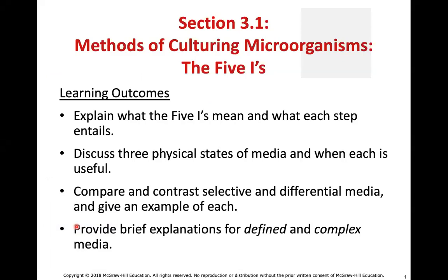Morning, all. So this chapter is chapter 3, which is tools of the lab or tools of microbiology. And we're going to go over a lot of the stuff that you would typically be doing within a microbiology lab. Pretty much cultivating these microorganisms, various tests to identify these organisms, and a lot of these concepts we will actually cover with the lab exercises that you do have on the online course.